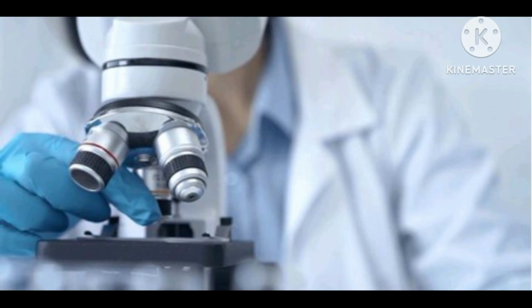A microscope is an instrument that produces enlarged images of small objects, allowing the observer an exceedingly close view of minute structures at a scale convenient for examination and analysis.